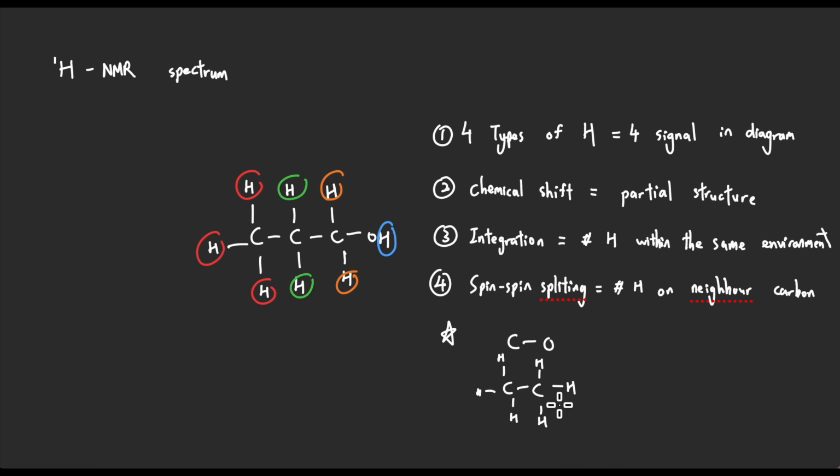You can't be your own neighbor, right? So these two carbons are not neighbors, but if we change one to OH, now they are not the same, then we can say that it is a neighbor. So first, the element that connects them should be the same. And secondly, their surrounding environment should be different, and hence they can be identified as neighbors.